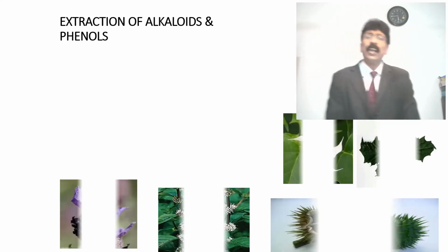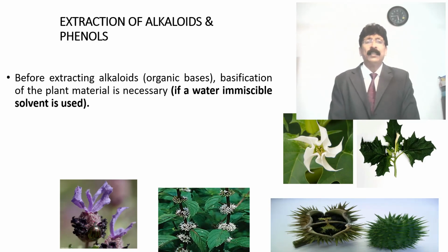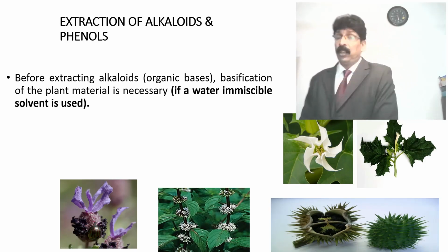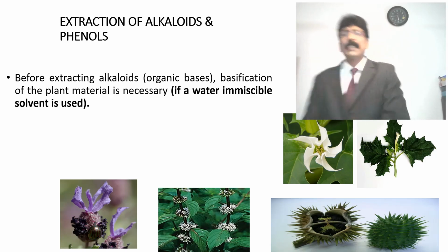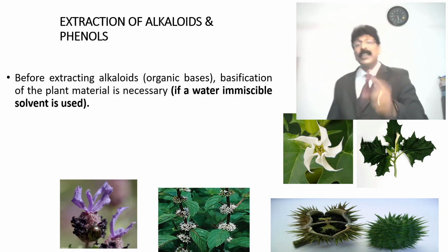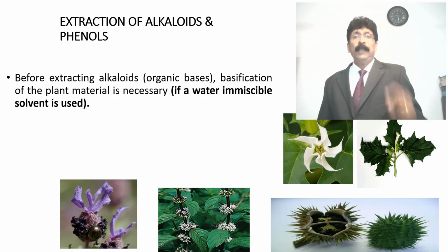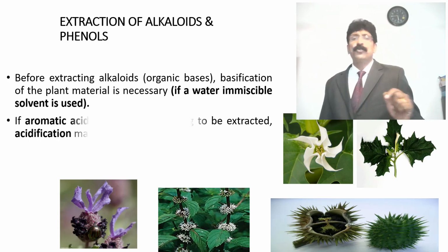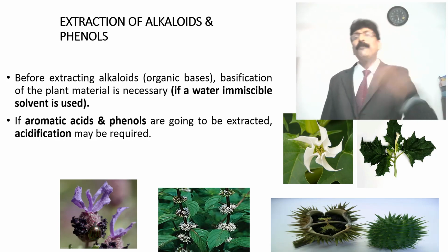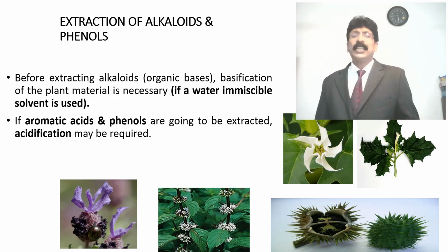Extraction of alkaloids and phenols. When you want to extract alkaloids, you know that alkaloids are nitrogen containing compounds, basic in nature. Basification of the plant is necessary before extraction if a water immiscible solvent is used. If you are going for extracting aromatic acids or phenols, acidification may be required.